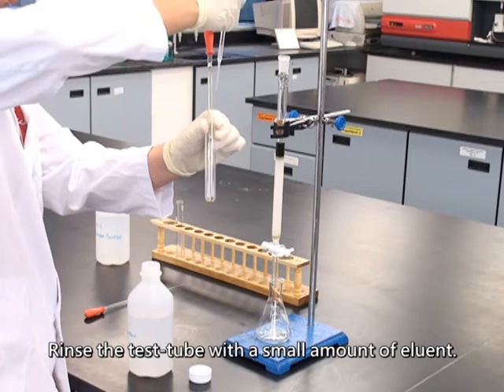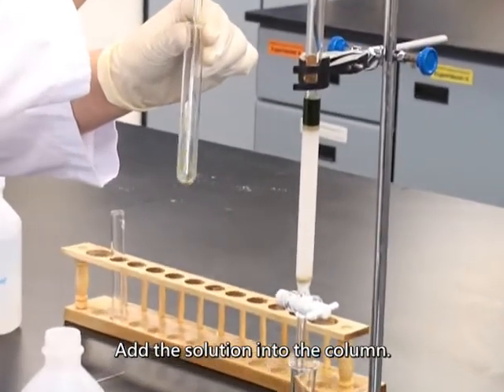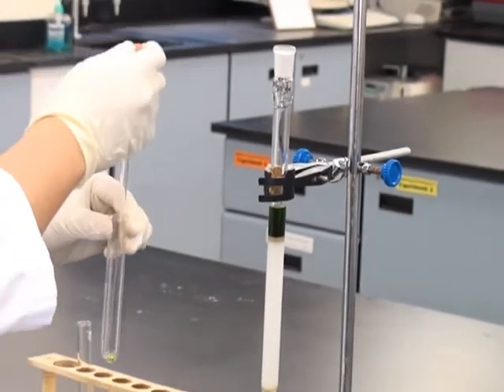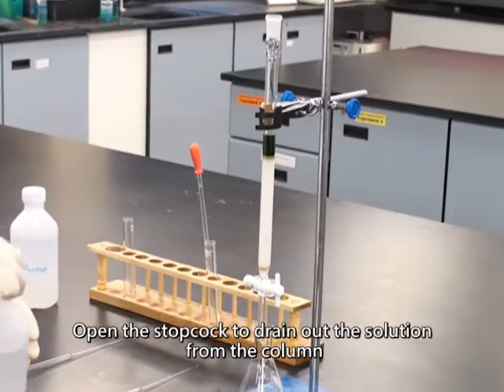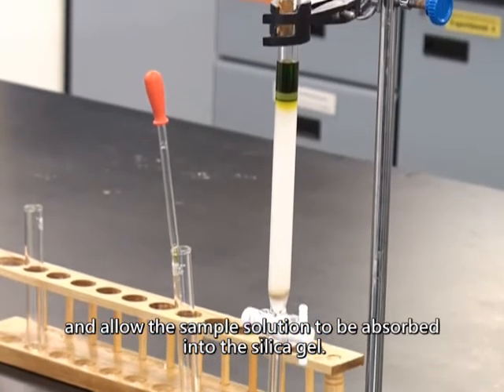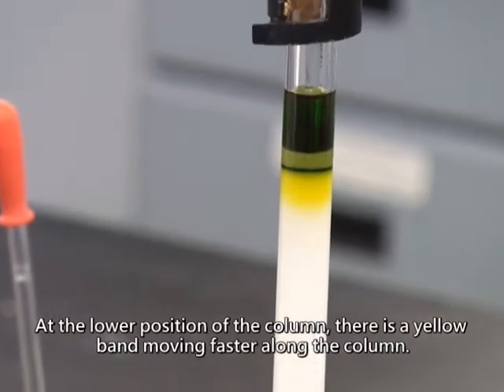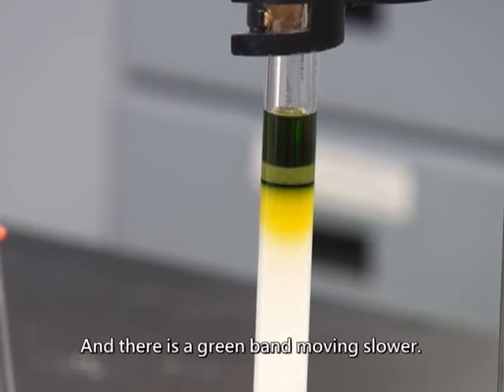Rinse the test tube with a small amount of eluent and add the solution into the column. Open the stopcock to drain out the solution from the column and allow the sample solution to be absorbed into the silica gel. Now you can see two distinct colored bands appear in the column. At the lower position of the column, there is a yellow band moving faster along the column.